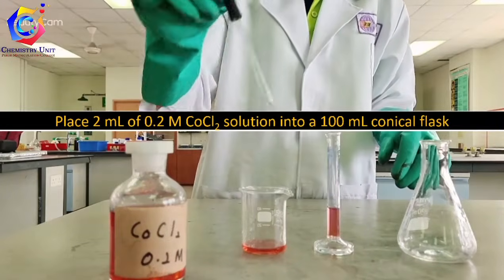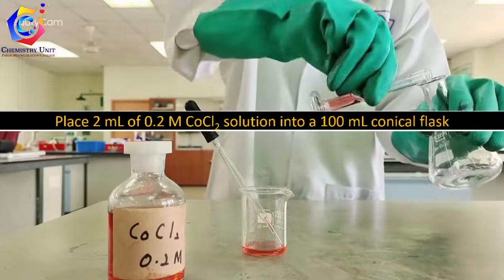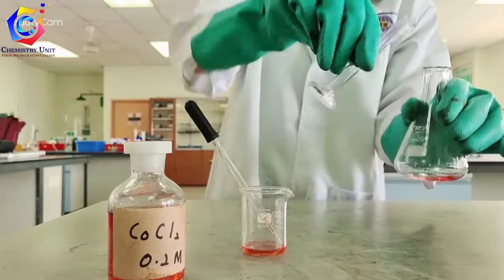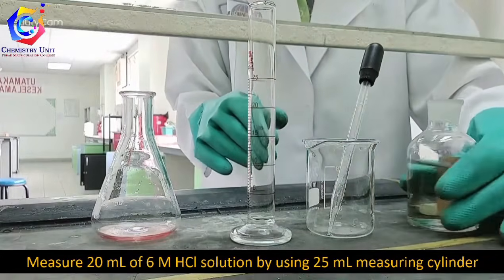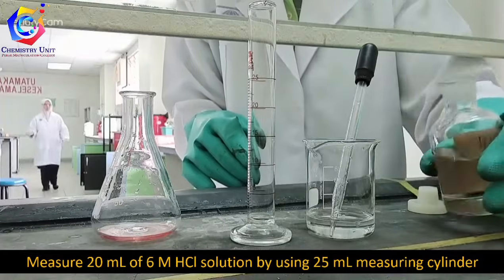Place 2 ml of 0.2 molar cobalt chloride solution into a 100 ml conical flask. Measure 20 ml of 6 molar HCl solution by using a 25 ml measuring cylinder.